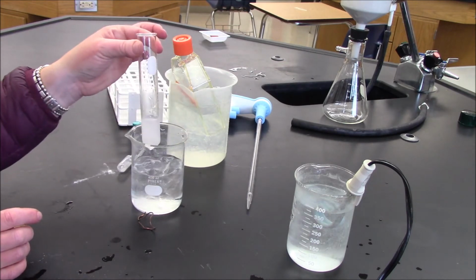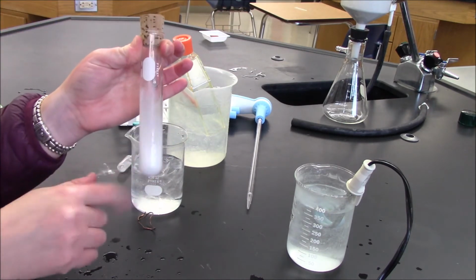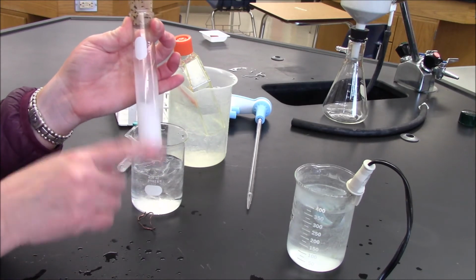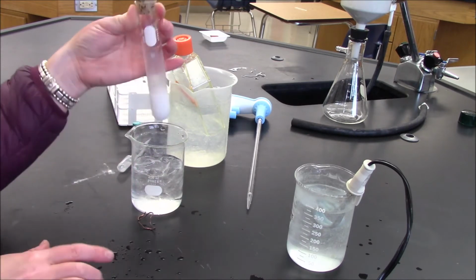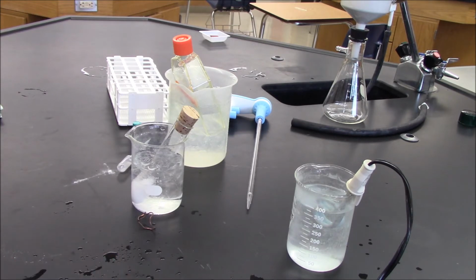I don't even really need to do that though, and I don't like shaking these anyway, so I'll just mix it. All right, and now I'll sit it in my ice water bath for about 5 to 10 minutes more. And when I come back, we'll be ready to filter using the Buchner funnel.